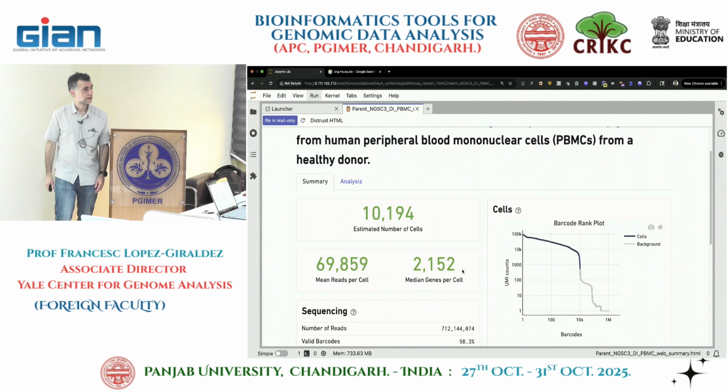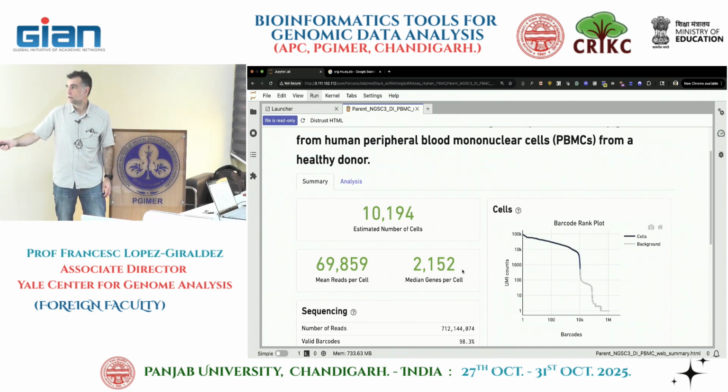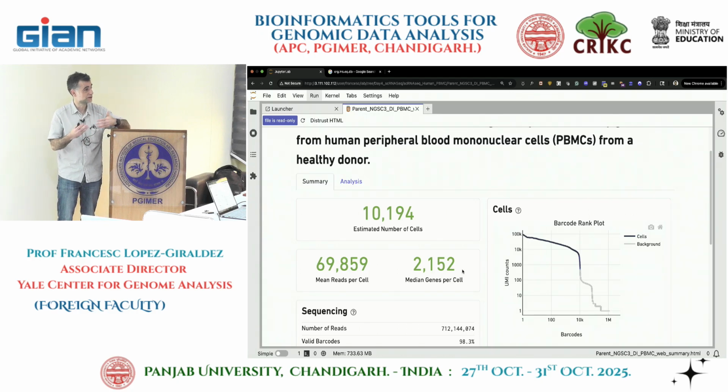So one more question. Is it like 20,000 reads for every kind of cell, or will it vary depending on the cell type as well? No, that's generic. I mean, there's no way. You don't know exactly. I mean, you may be in a situation where, I don't know if that's even possible, but you're expecting low transcription, but you still can sequence very high. But I don't know. It's always hard to evaluate. PBMCs, you have everything, so it's pretty normal that you at least need 20,000, right? So it's like the median genes per cell into the coverage, which is into 100, which will give you into 10.